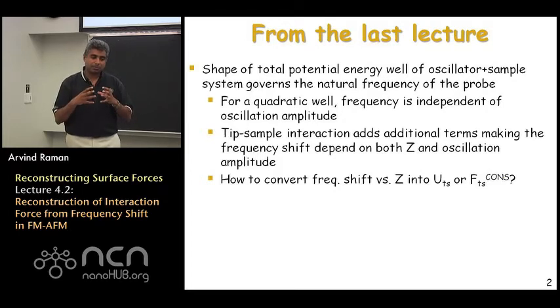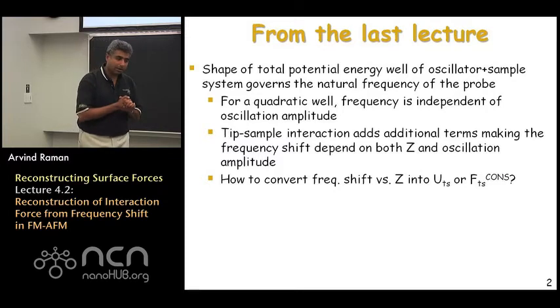So this gives us a very nice idea of how to relate potential energies to frequency shifts, but we are interested in becoming quantitative here. What we really want to do is to convert the observed frequency shift versus Z into the conservative tip-sample interaction force. So today we're going to talk about the methods that are out there in the literature to actually make this reconstruction.